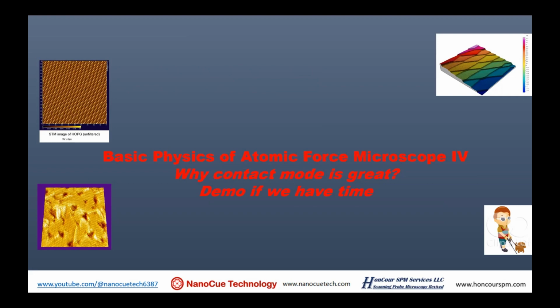And I said, oh yeah, contact mode, that's a good topic, because I would like to make the point that the atomic force microscope is a difficult instrument to master, and the image that comes out highly depends on your skill and your understanding. It's almost like the relationship between a camera and your picture, or a piano and your music.